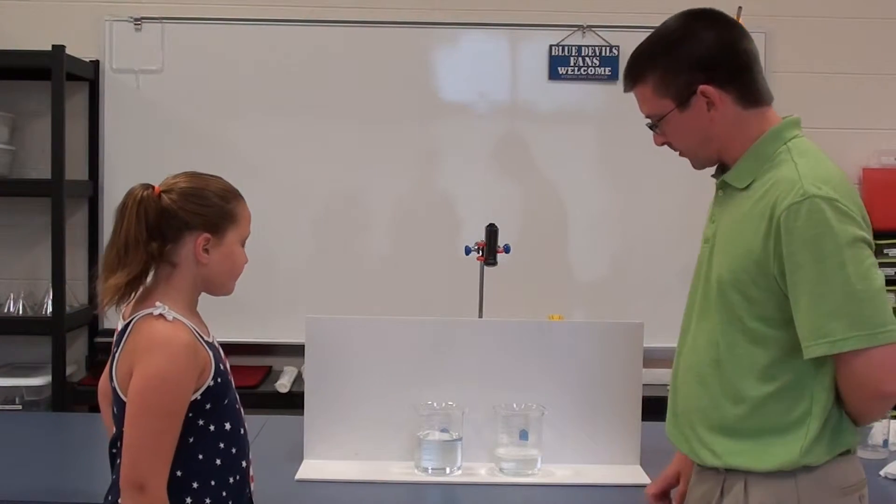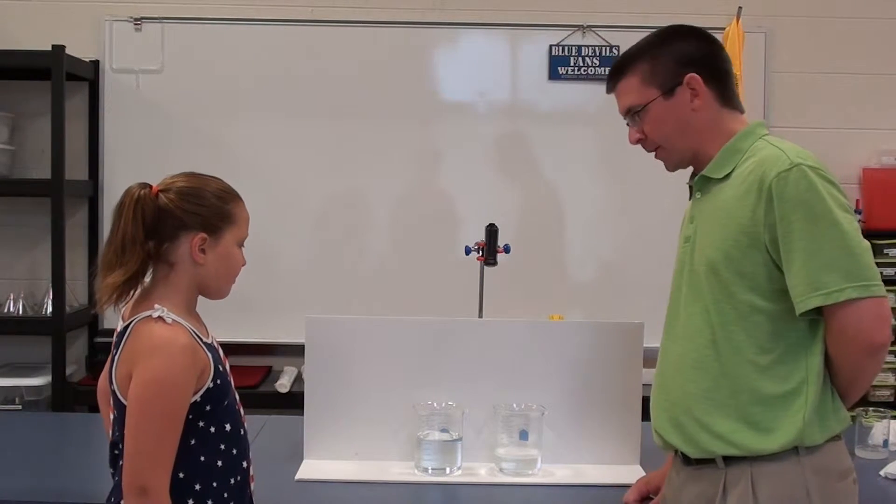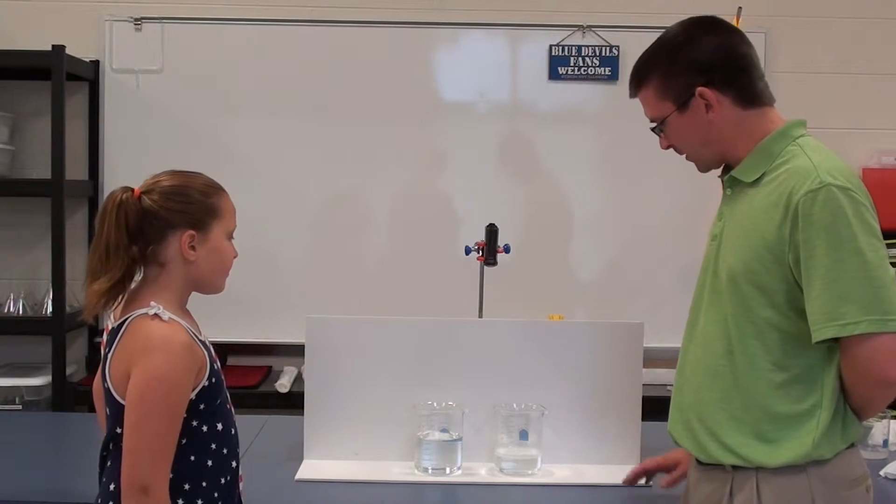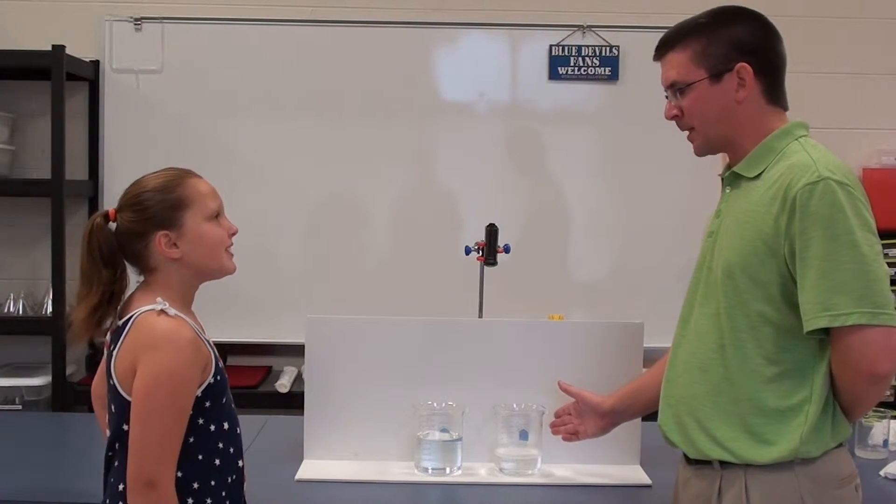And we've got two beakers here. The first one has some vinegar in it, and what do we know about vinegar? It's an acid. And the second one has ammonia, and ammonia is a base.